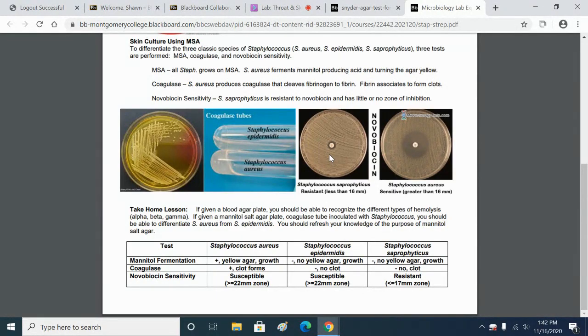And so sometimes you do get results that don't exactly match because bacteria do have different strains, different mutations. And when it comes to doing unknowns, if you were actually doing your experiment in class, carrying out all the different tests, some of you would find that your results don't match exactly because sometimes the bacteria just don't do something that they normally do.